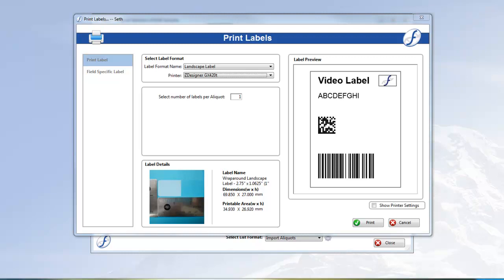Today, we'll go over all of this, as I show you how to design a label format in FreezeWorks.